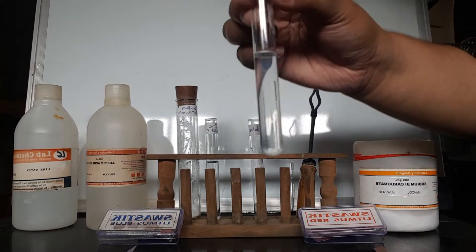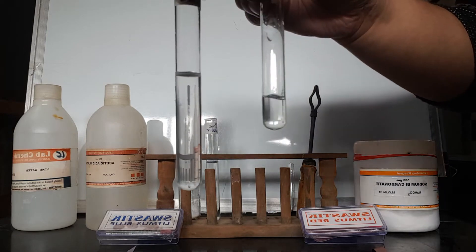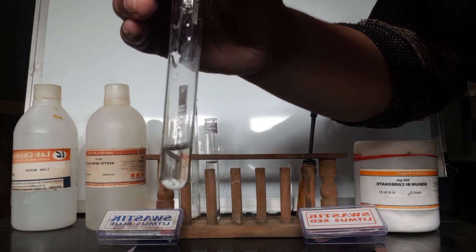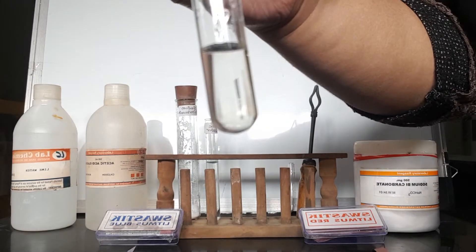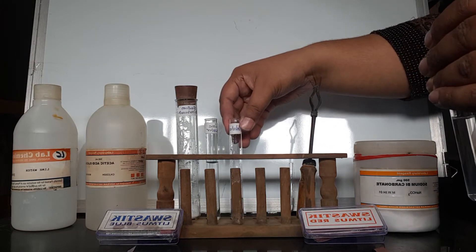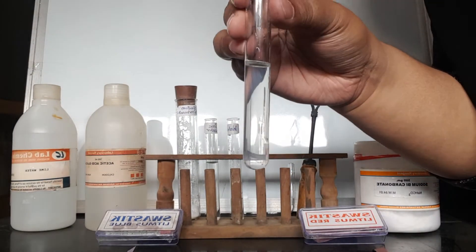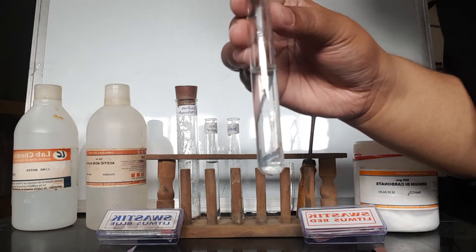Next, we have to test this acetic acid with water. We add acetic acid into water, and the acetic acid completely dissolves in water. So for solubility, we write that acetic acid dissolves completely in water.